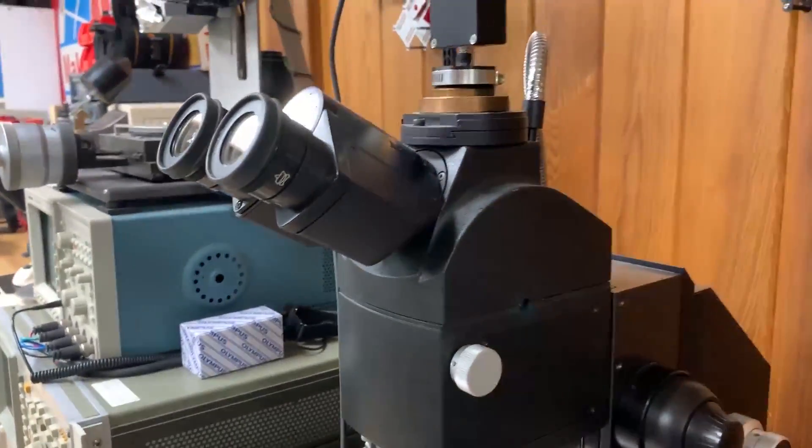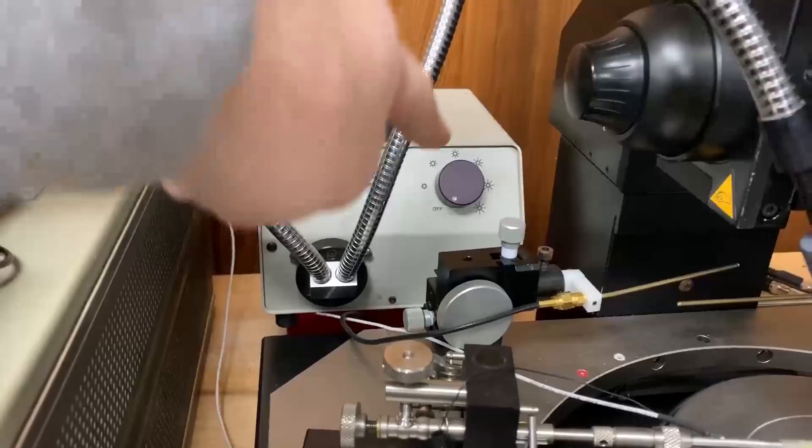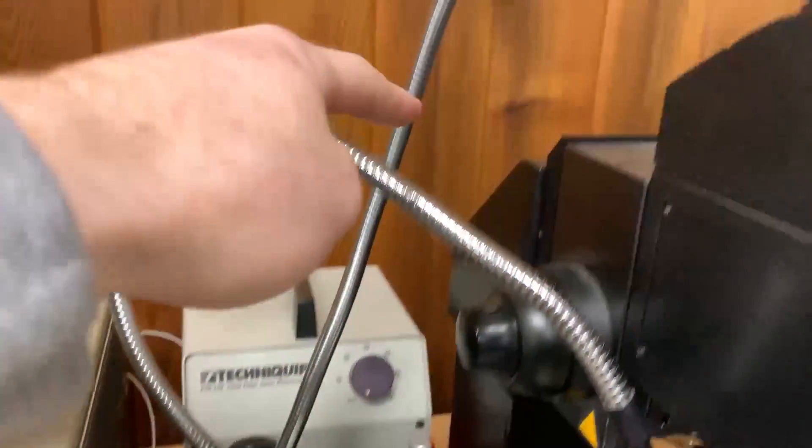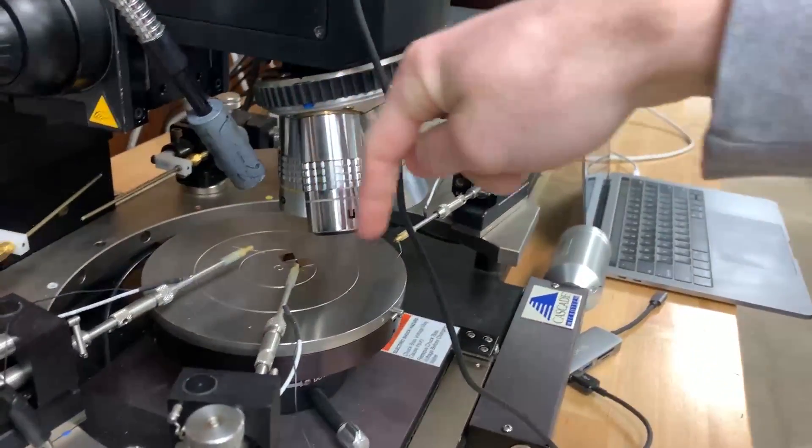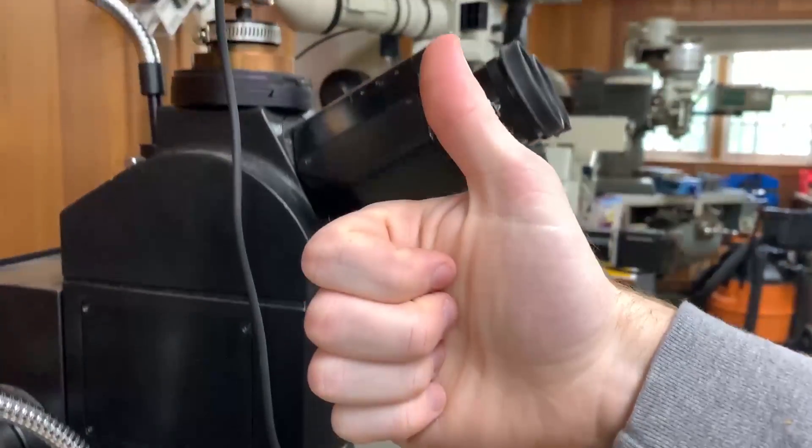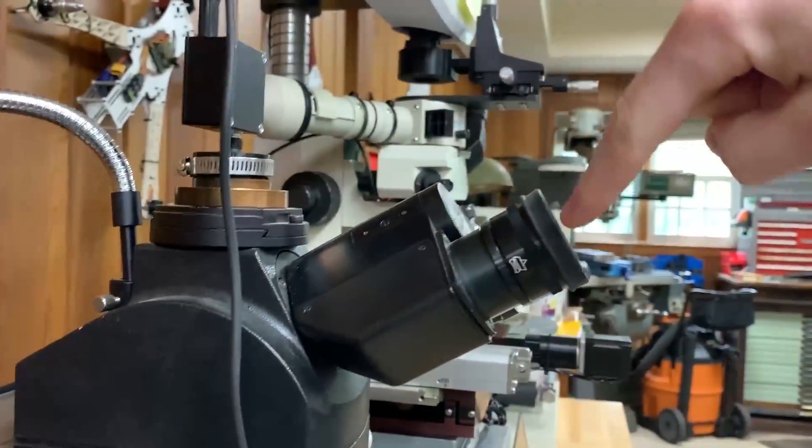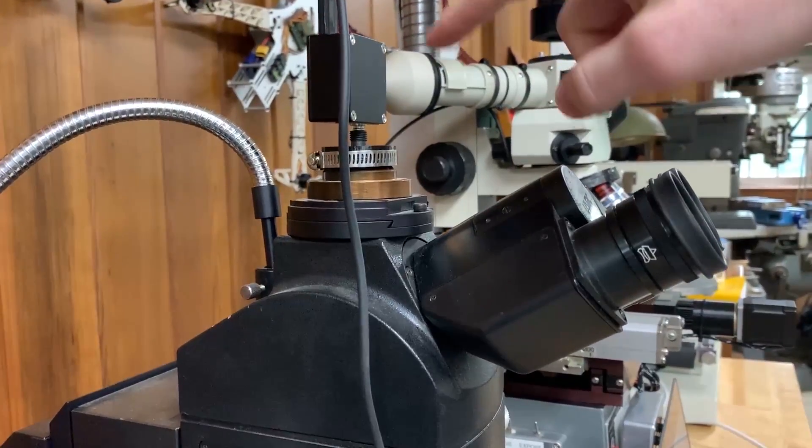So I have a illuminator that's just like a halogen light bulb inside this standard microscope illuminator. It comes through this fiber optic gooseneck thing shines down in axis with the microscope comes out the objective hits the sample and then that light comes right back up in the same axis and some is split off for the eyepieces of course which isn't really important and the rest of it goes into the spectrometer.